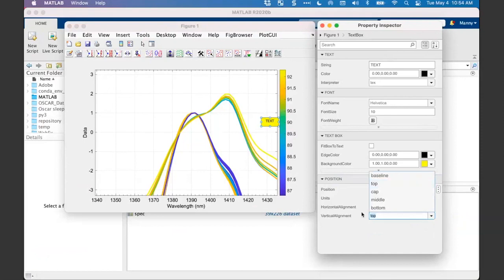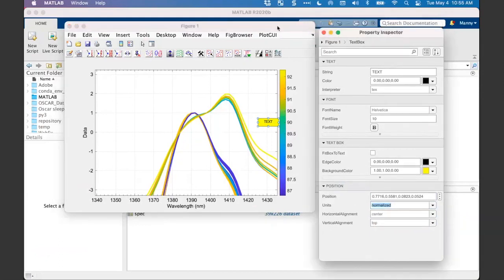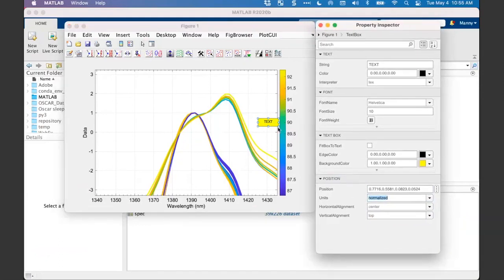Yeah, this is the same thing. So these are normalized to the. I am sure there are ways to rotate this. Yeah, I just did it myself with the X label function in PLS toolbox on the command line with MATLAB. But yeah. Hey, Manny. Yeah.